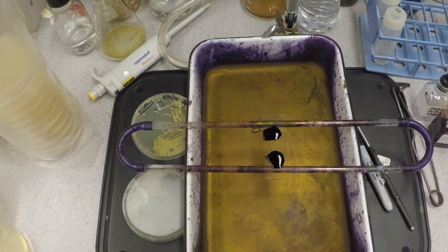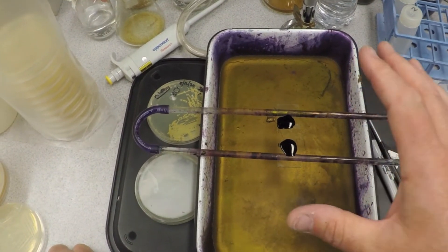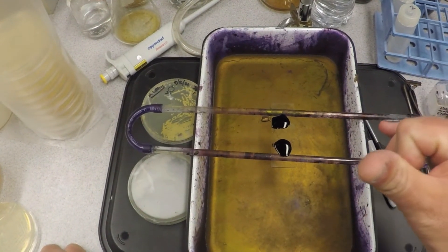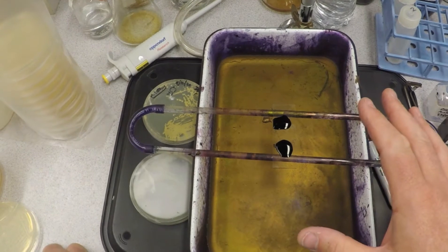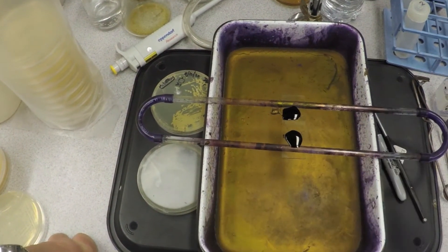You let this sit for 30 seconds to a minute or so. What this is doing is penetrating the interior of the bacteria. If we looked at them under the scope right now, they'd all be dark purple — the color of crystal violet — both gram-negative organisms and gram-positive organisms look exactly the same at this point.